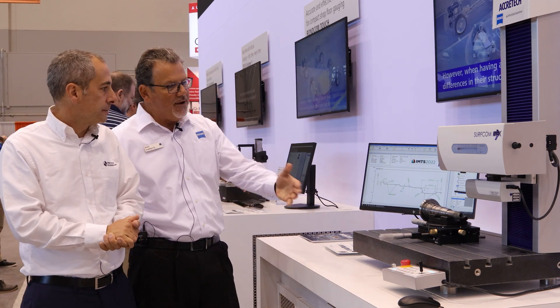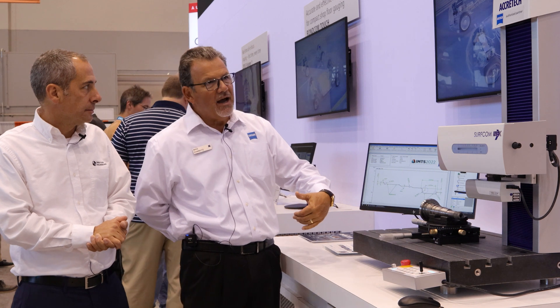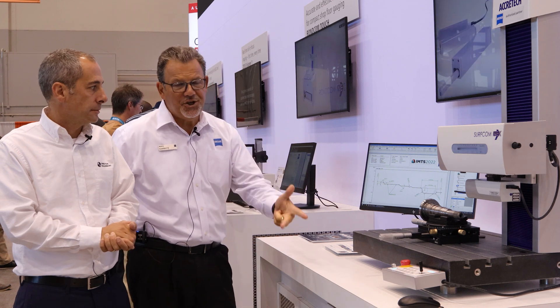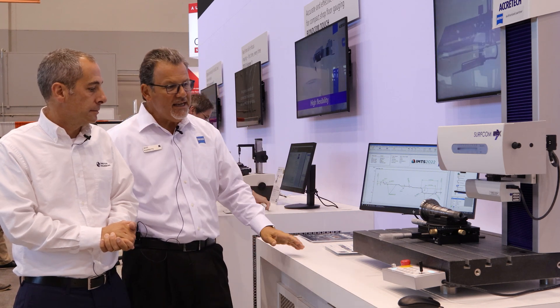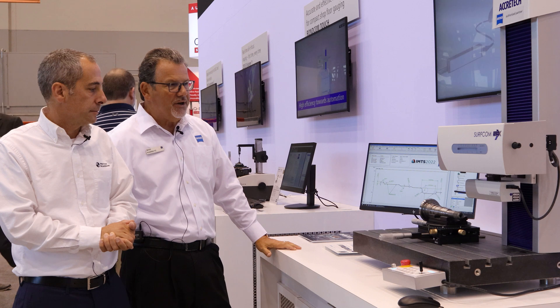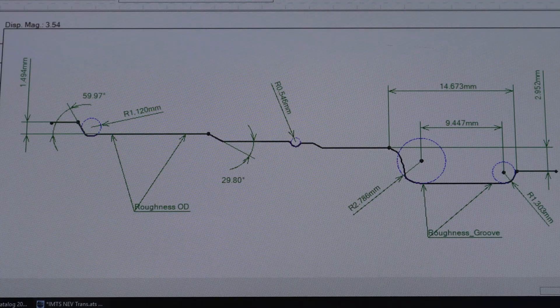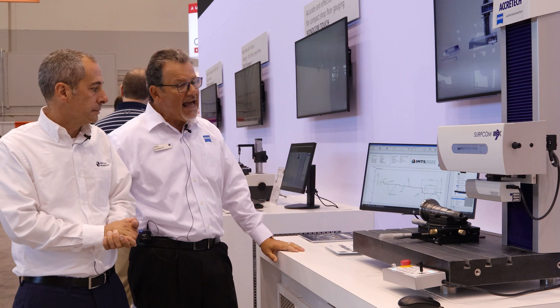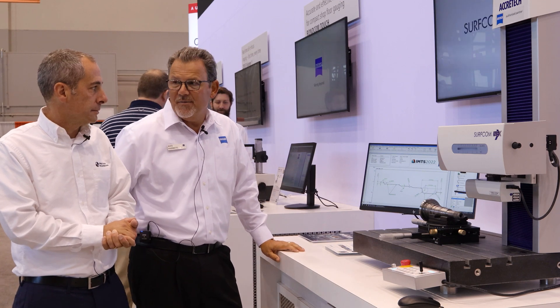We also have a new interface — an Ethernet connection which has a very fast, low noise, secure connection to the PC that we've included on the machine. We're using the ACTI software, the module for contour and roughness, to do the analysis that is available on the machine.